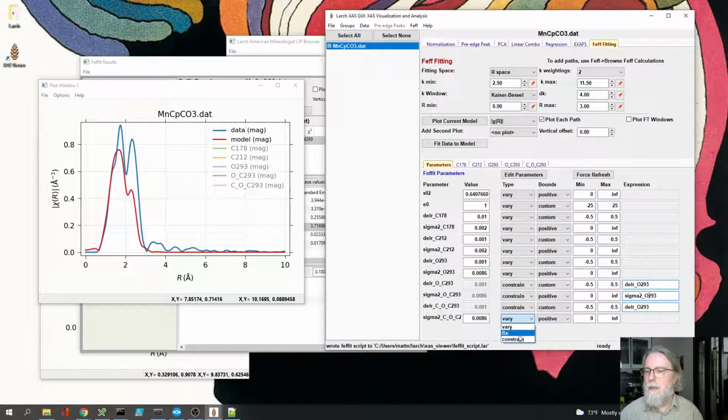That is, you may say that the disorder for a multiple scattering path has to include the fact that the middle atom might move so that the distribution of distances that you see is slightly bigger. It won't be smaller, I'm almost certain, but it might be bigger. But for now, I'm just going to assert that they're all the same, so that we still actually have 1, 2, 3, 4, 5, 6, 7, 8 variables.